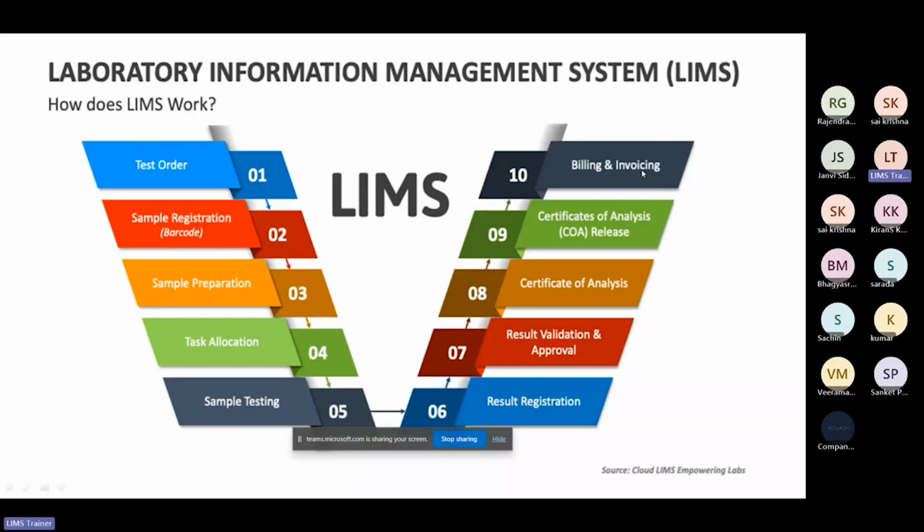Yes, that's it. Validation for software is a very hard term, but for general routine testing or your parameters also, we validate all the things, right? For testing, and for all the batches we are producing in the manufacturing industry, we go for validation. Why validation? Because we want quality and a confirmation that whatever we are producing is a quality product. So that's why we validate each and everything.